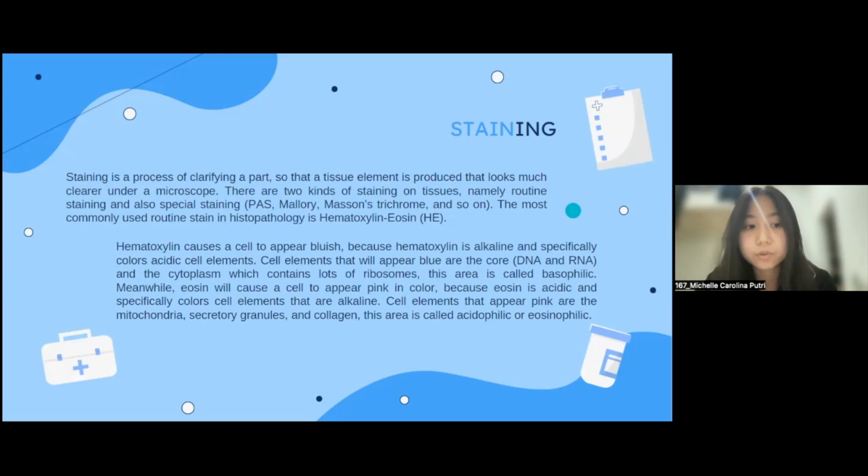In order to produce the best staining results, it requires materials and procedures that are carried out properly.